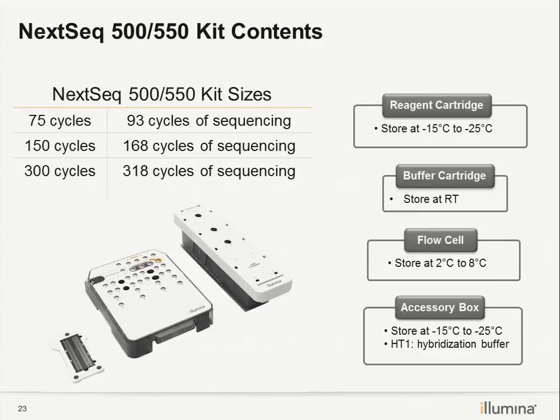So why is it so generous to give a few more cycles? It is because what we call a 300-cycle kit is supposed to be 2 times 150 base pair of sequencing reagents for your insert. If it provides 2 times 150, then you can make use of the whole reagents to sequence your insert. And the extra cycles are required for the index reads.